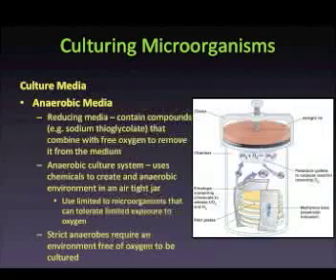A small amount of agar is added to the media, making it very thick. When the sample is autoclaved, oxygen is driven out of the sample, and as it cools, oxygen diffuses into the media from top to bottom, forming an oxygen gradient.